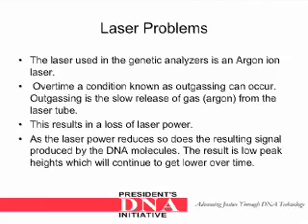The laser used in the genetic analyzers is an argon-ion laser. Over time, a condition known as outgassing can occur. Outgassing is the slow release of gas from the laser tube, resulting in a loss of laser power. As the laser power reduces, so does the resulting signal produced by the DNA molecules. The result is low peak heights, which will continue to get lower over time.